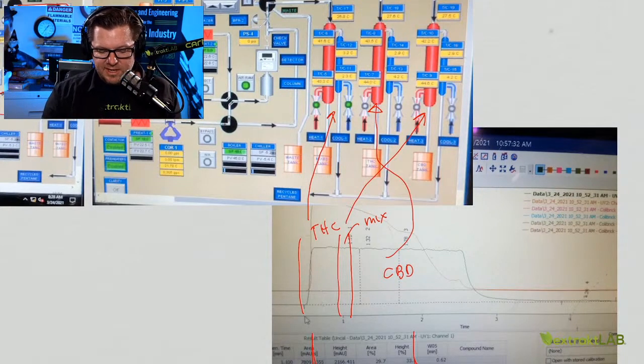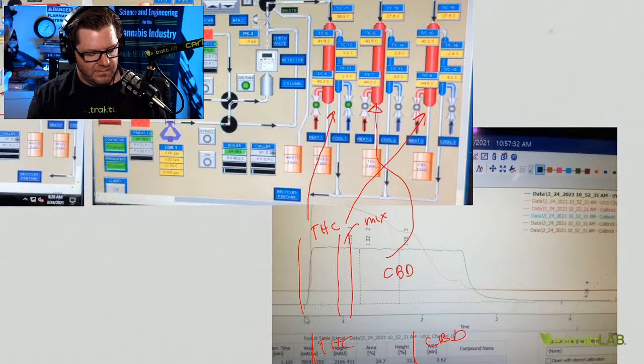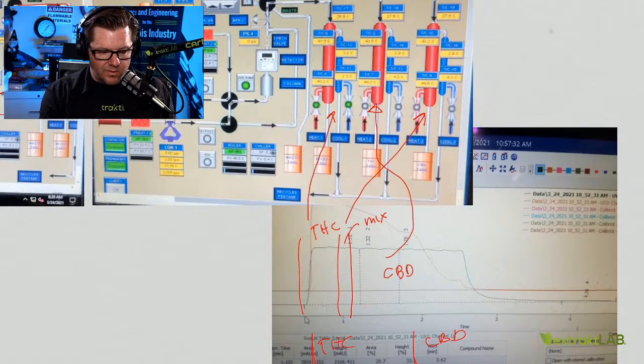So you can see that here's your THC coming out right here. Here's your CBD coming out right here. And typically you would measure the area under the curve here, and you'd be able to know, okay, there's 5 milligrams of CBD in that sample, and there's 1 milligram of THC in that sample, for example.